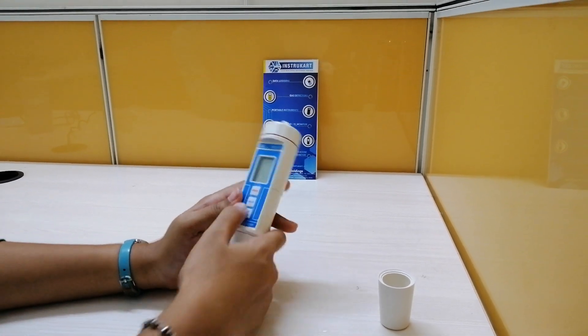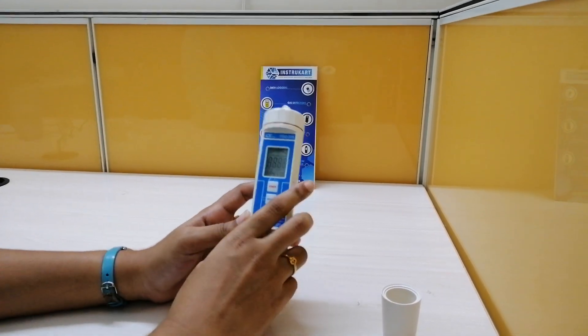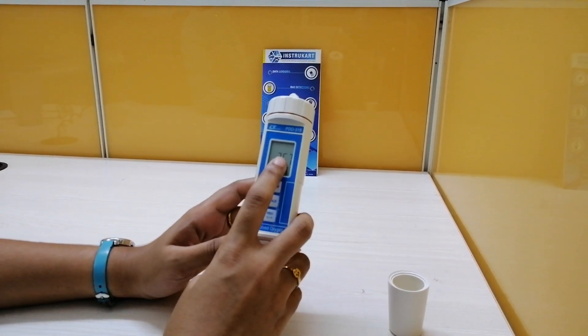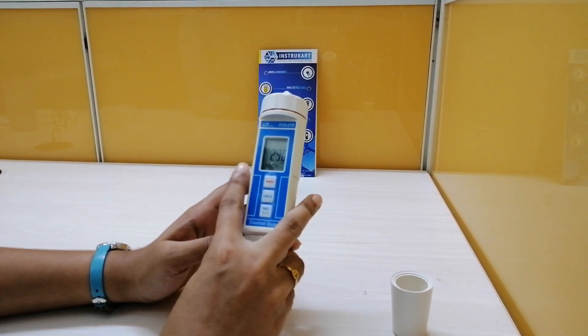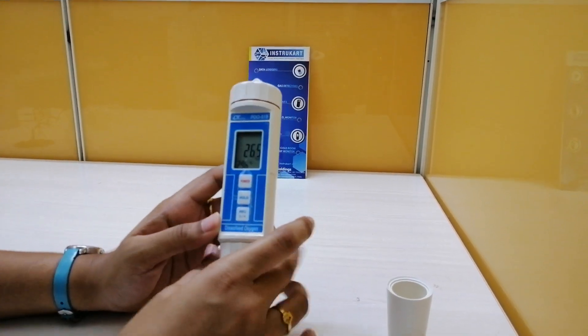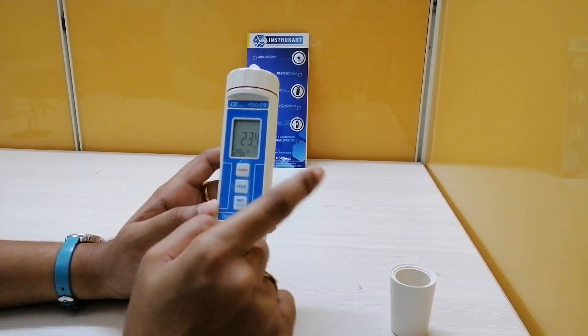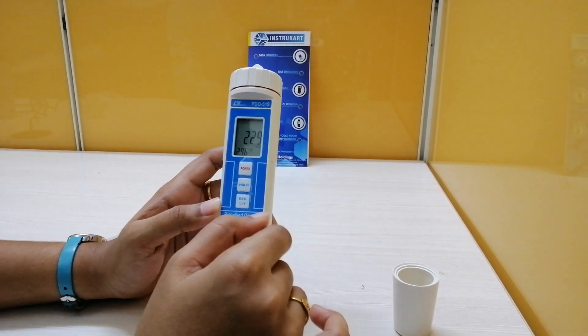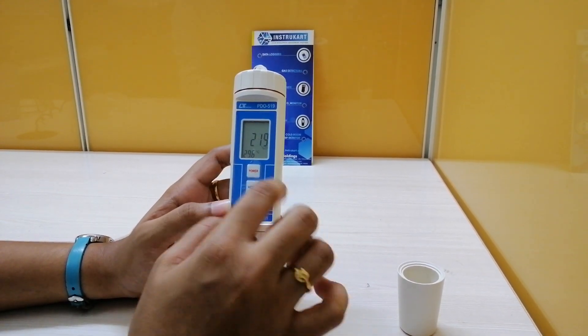Let me turn on this device. You can see the display here, and the display is 29 mm by 28 mm. Here it is currently showing oxygen in air — it is 23.7%, which is fluctuating right now — and the temperature is 29.6 degrees centigrade.